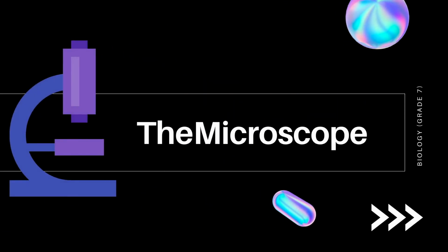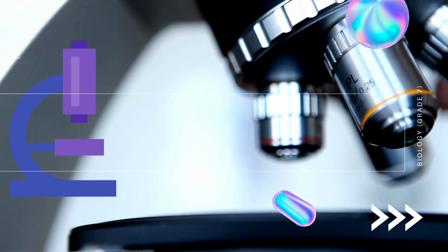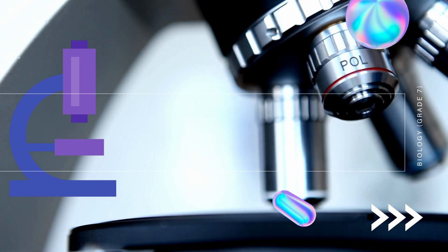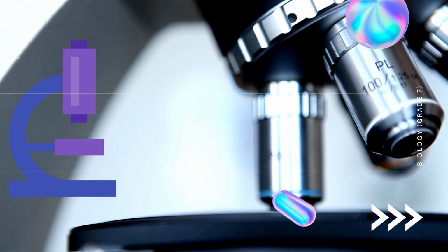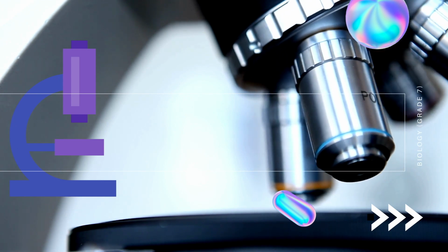In the science of life, instruments are a big help in understanding the dynamics of living things. One of the instruments that help humans in discovering things that are unseen by the naked eyes is the microscope. Micro refers to tiny, scope refers to view or look. Microscopes are tools used to enlarge images of small objects so that they can be studied.